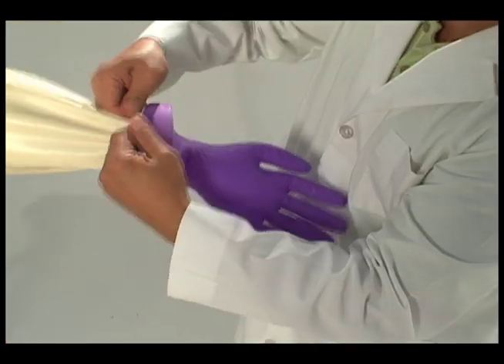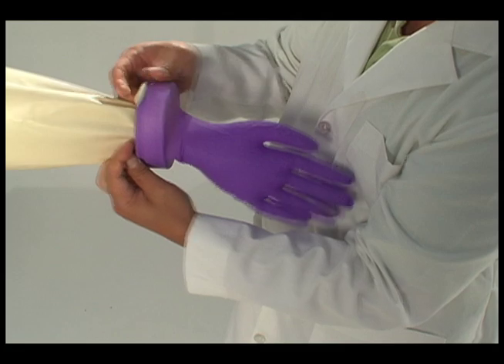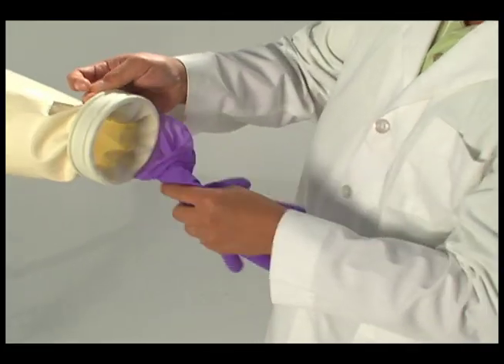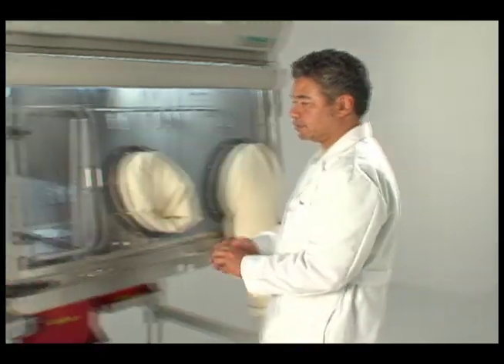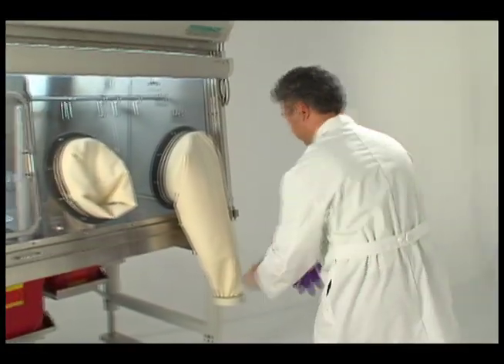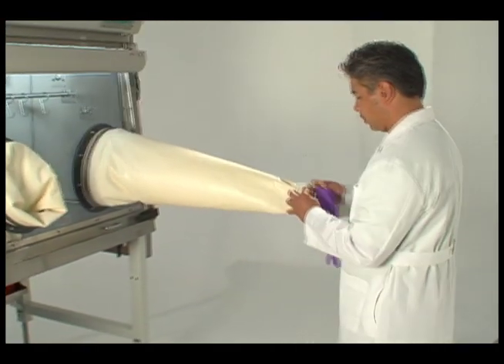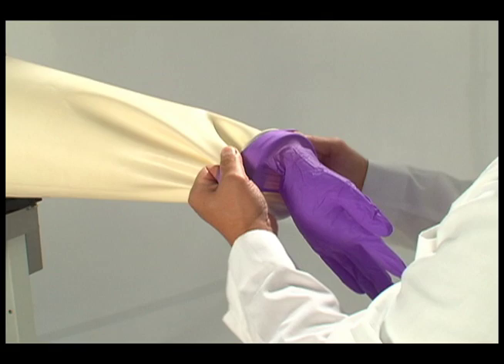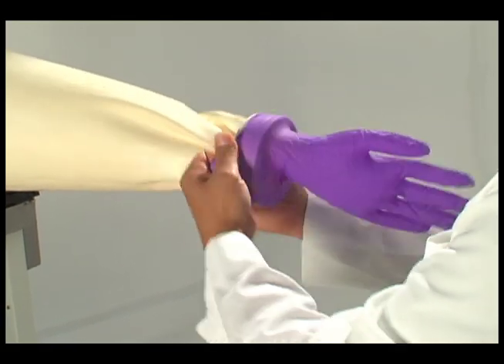Remove the stainless steel holding spring, which holds the glove in place. Pull the old glove off the glove ring and replace using an approved glove, stepping it into place on the glove board.